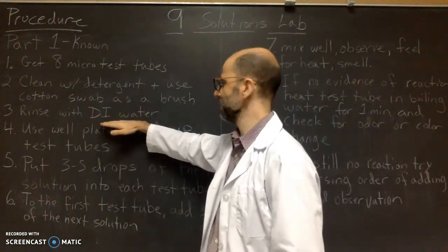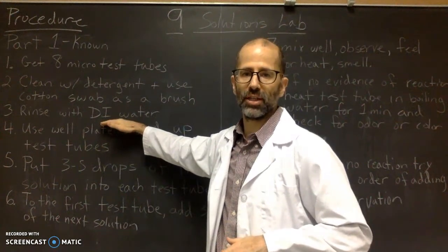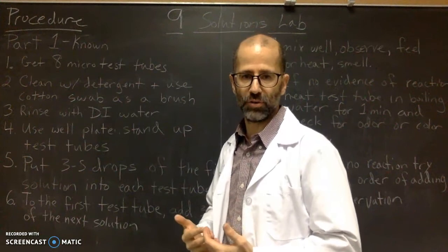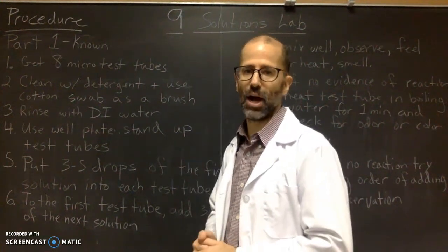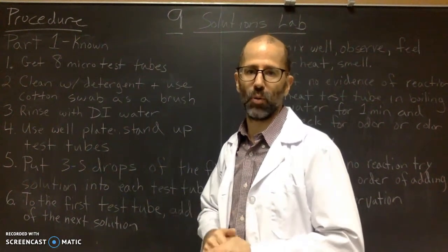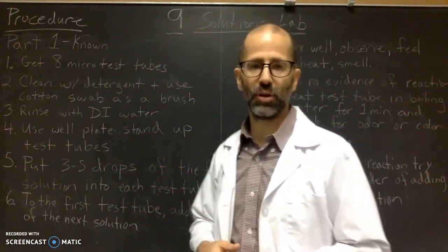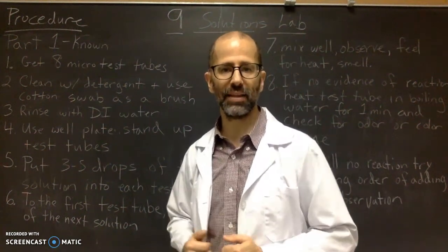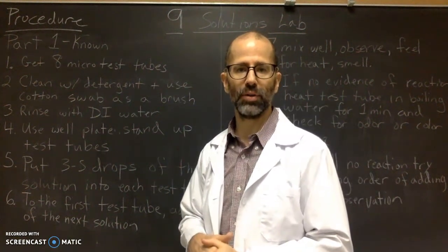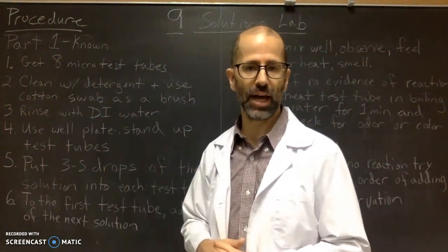So rinse them out with DI water, not sink water, right? Whenever you're using water for reactions, you always want to use DI water. If you're rinsing things out that you're going to use to mix chemicals together, you don't want to use sink water or tap water, you want to use DI water. Okay, so there's a special DI water sink in the lab, so make sure you go there and fill your water bottle up with DI water, so you have a water bottle with DI water that you can use at your lab station.